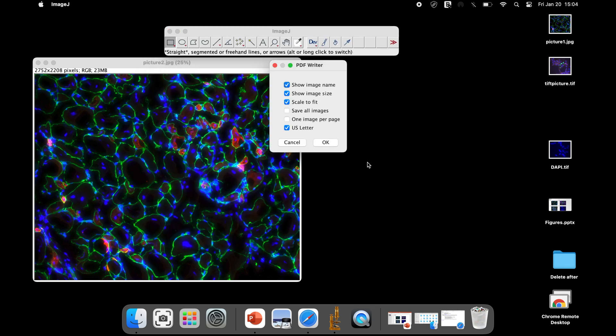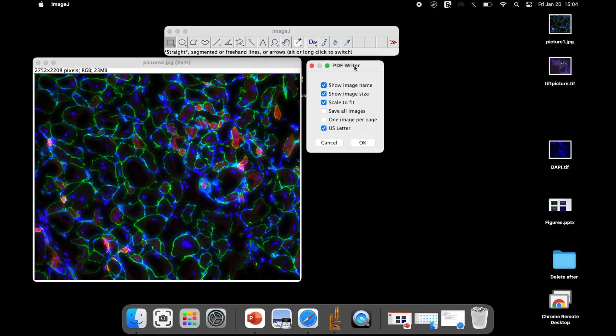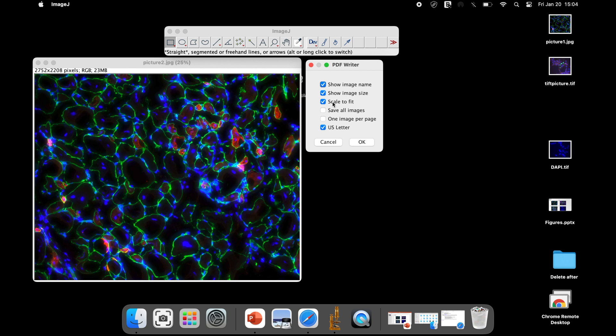Now, a PDF Writer dialog box pops up. The following options can be checked or unchecked according to your choice and convenience. If you have multiple images to convert, then save all images and one images per page can be checked.